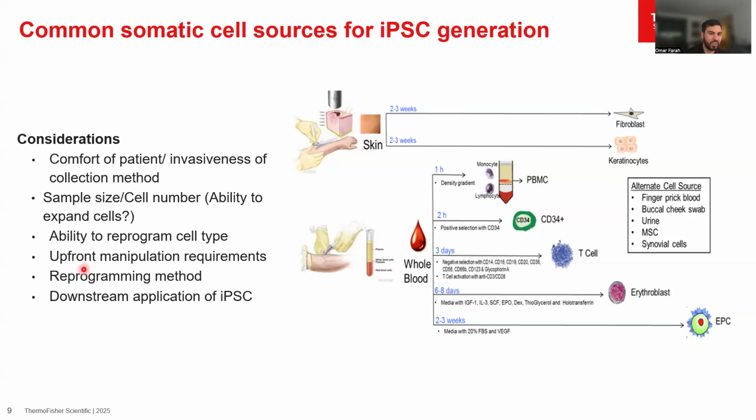And again, we talked a little bit about this, but upfront manipulation requirements, the reprogramming method itself, and then your downstream applications of your iPSCs.